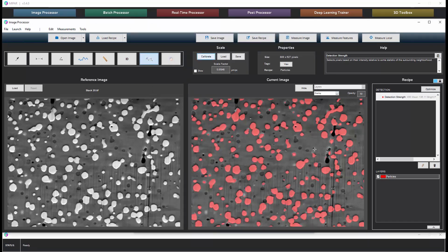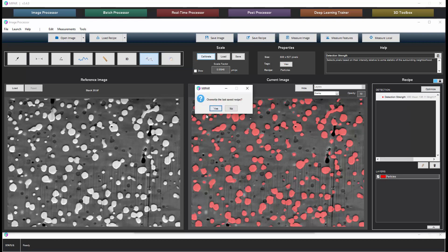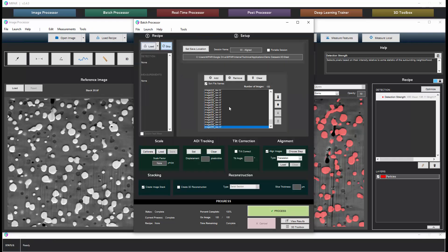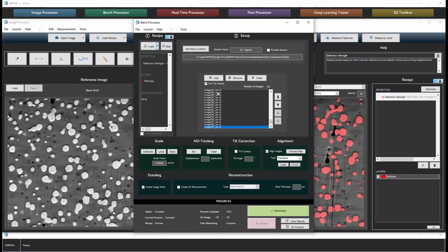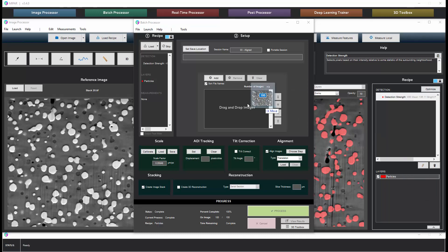Going back to our recipe we have it set with the scale factor. So let's save it. And now we'll go back into the batch processor to apply this to all slices so that we can get a reconstruction. We will load the recipe and we're going to process now the aligned images that were output from the 3D toolbox.